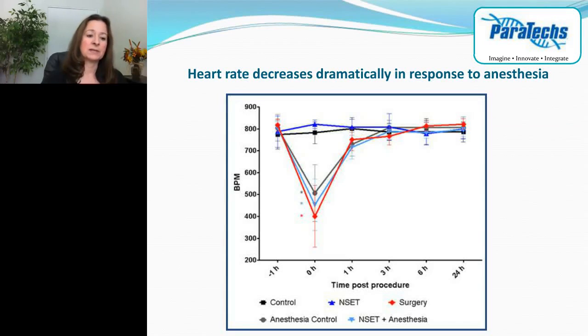In this experiment, heartbeats per minute are graphed at various hours post-procedure for, again, the 2.5 DPC pseudopregnant CD1 mice. Data was analyzed by mouse specifics using EZCG analysis software.